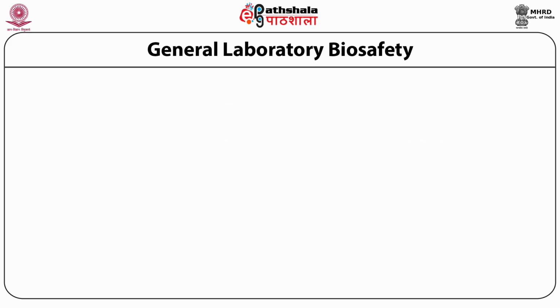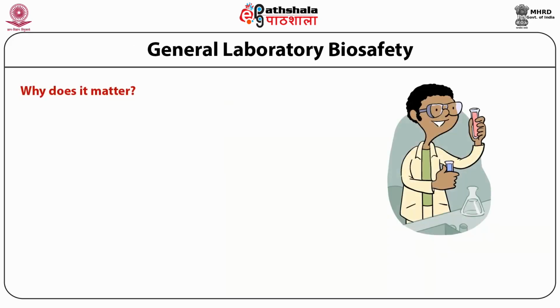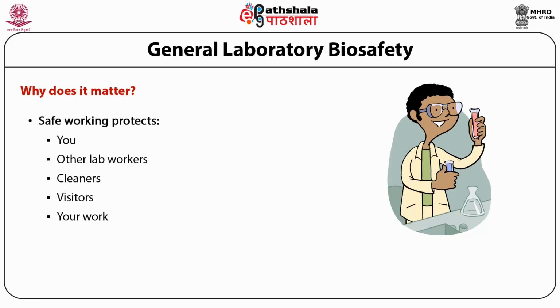So what is general laboratory biosafety? Why does this biosafety matter to us? Biosafety is about safe working practices. It is safe for you, for other lab workers, for cleaners, for visitors, and most importantly for your work.